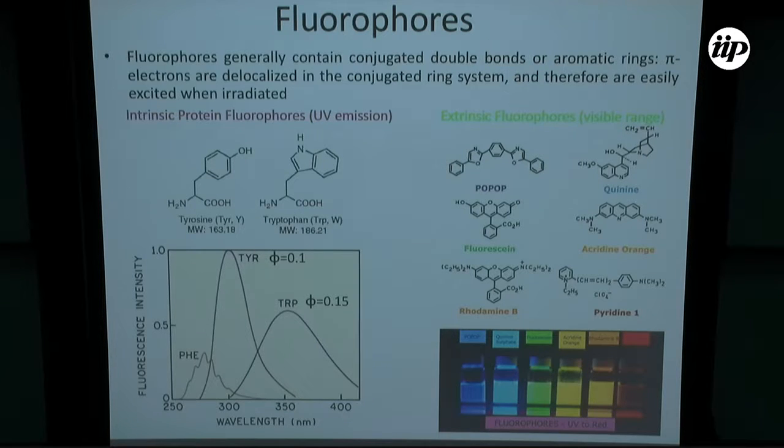They also have very high extinction coefficients, which is important because you want to make sure that the cross section for absorption is high, because you will have only one molecule in your measurement volume. And also they have typically very high quantum yields. The closer to 1, the better. So there is one parameter that is actually the product of the extinction coefficient times the quantum yield, which is the brightness of the fluorophore. And the higher the brightness, the better, okay, especially for single molecule.